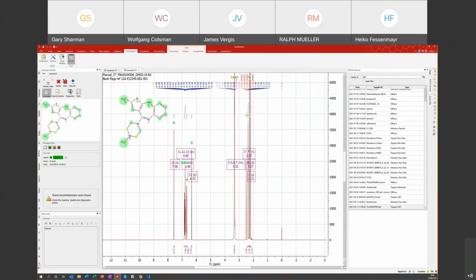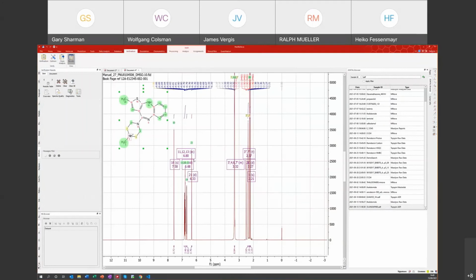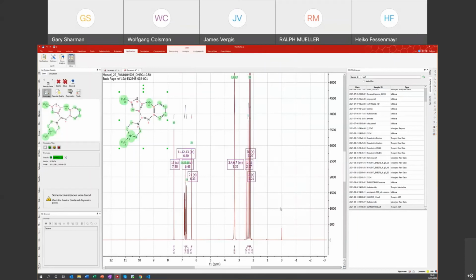And in fact, here, just as an example, it's kind of a nice example, because if you assume that nitrogen there is charged rather than not charged, and then I rerun the analysis, you'll see that the match improves slightly. So this is the kind of thing maybe a scientist would be doing at the bench in analyzing their sample. So now I've done that, I've assigned my NMR spectrum, everything's ready. What if I need to store this again now so people can see it in the future?